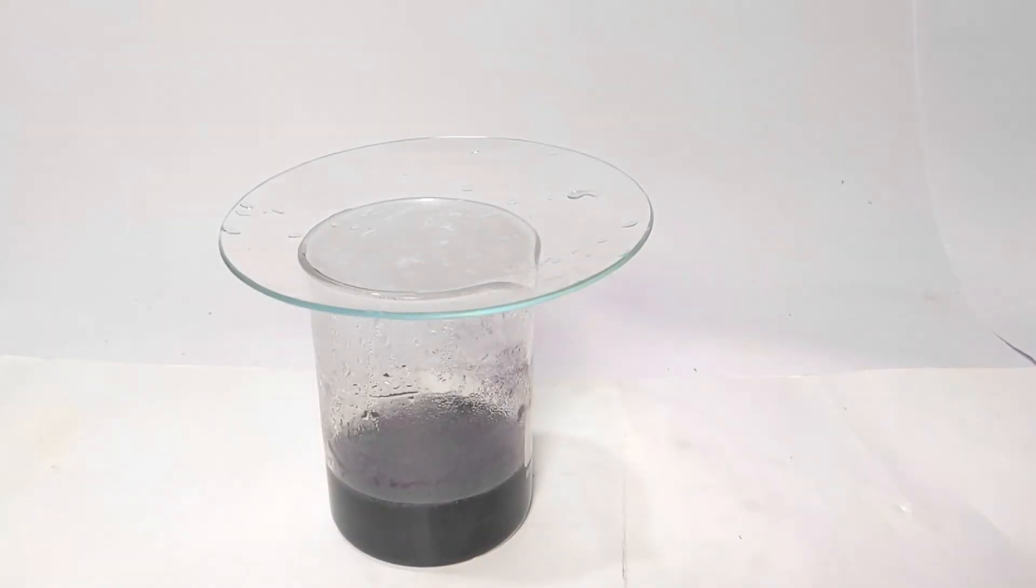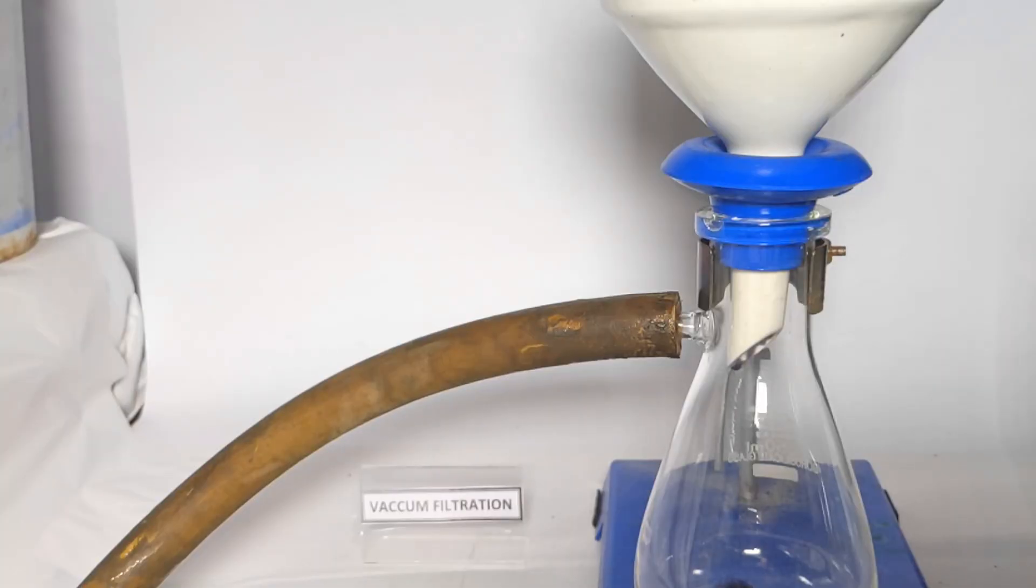By 90 minutes you can see the color of the solution has turned from green to purple and a solid has started to form. This is the product. The beaker was then cooled to room temperature. This will help crash out more of the product.